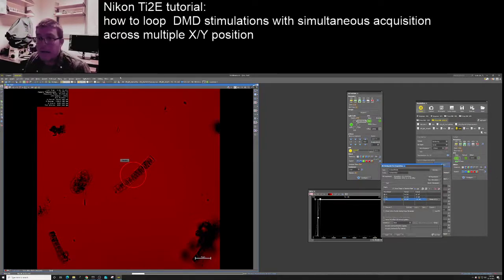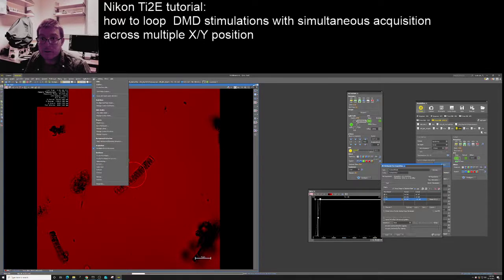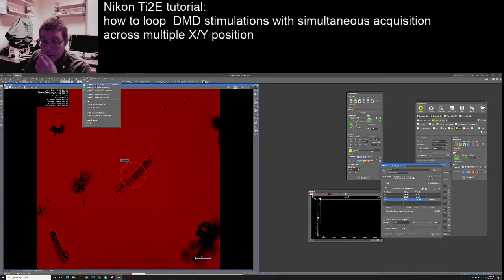There's a few ways you can try to do it, but the easiest way I found is, if you go under applications, the standard ND acquisition that people have been using is this, and then there's a few different time sequencing or multi-point sequencing variations on the ND acquisition you can use, and the one that works really nice I found was define run ND multi-point set acquisition.